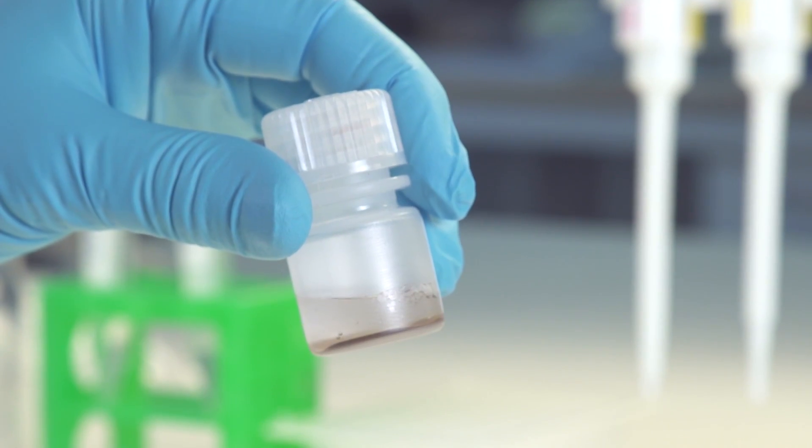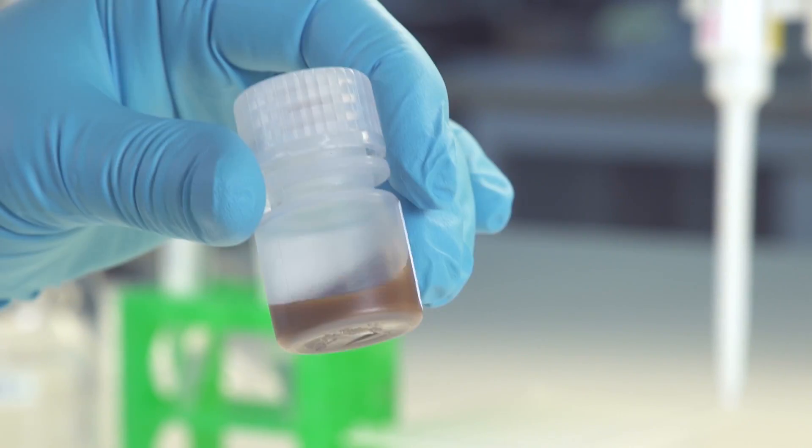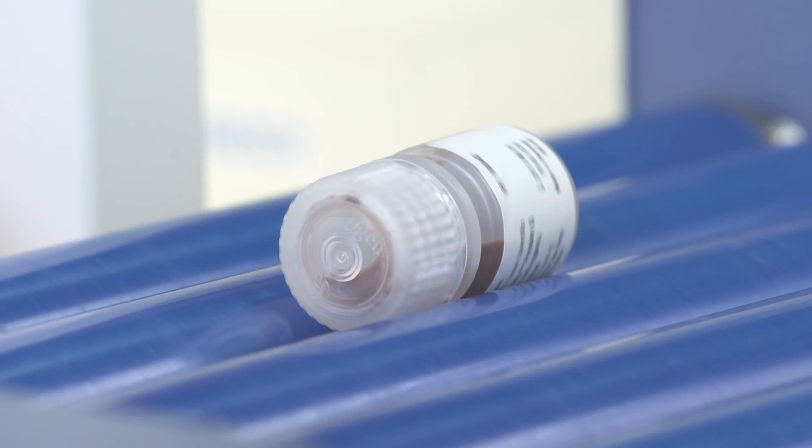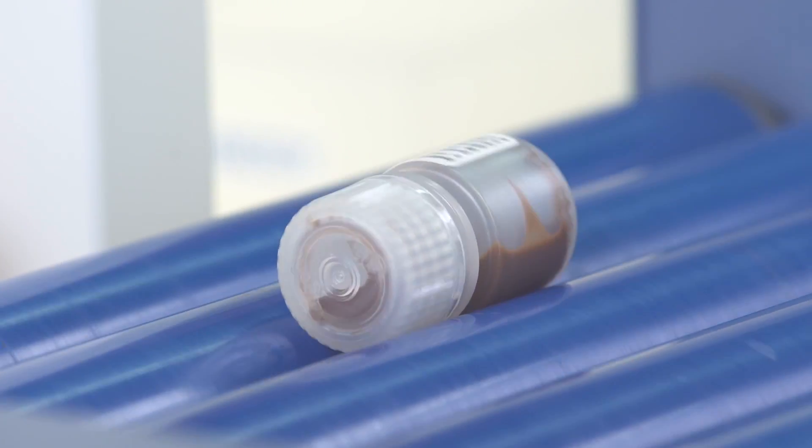DynaBeads are resuspended in the vial to a homogeneous suspension to ensure high reproducibility when performing IP. Proper mixing can be visually inspected, showing an evenly distributed brownish color.